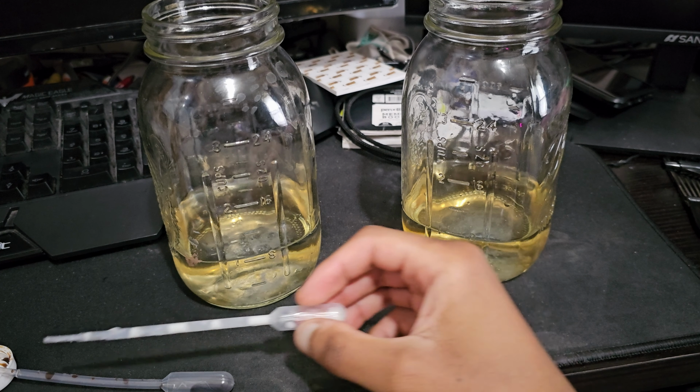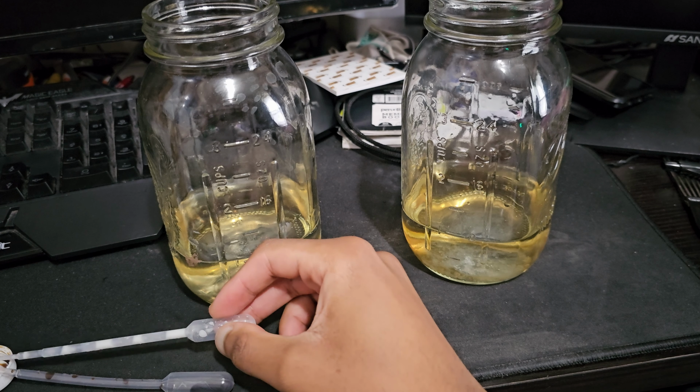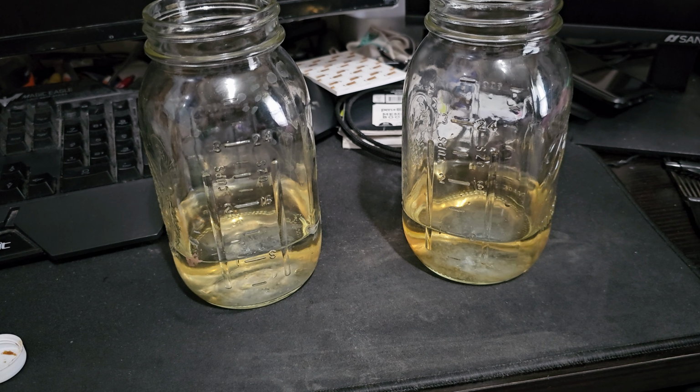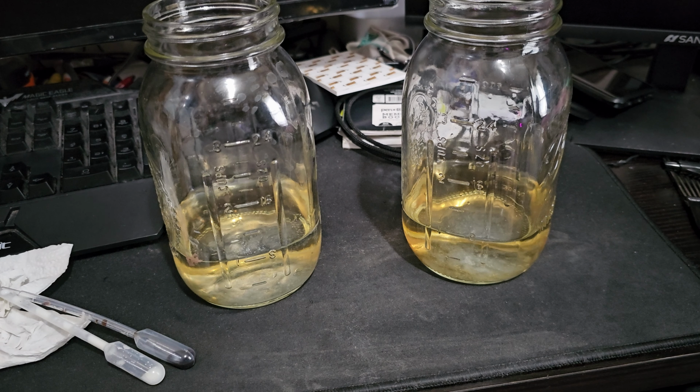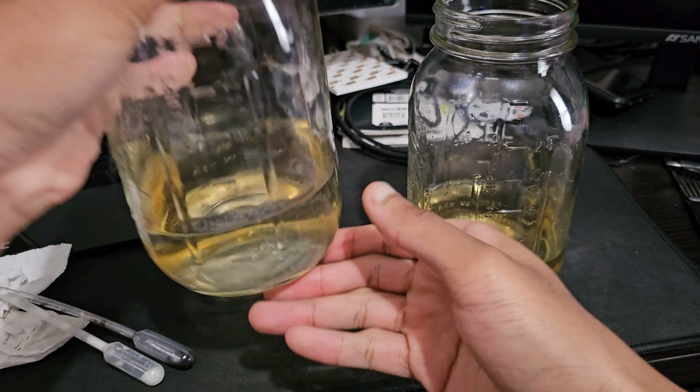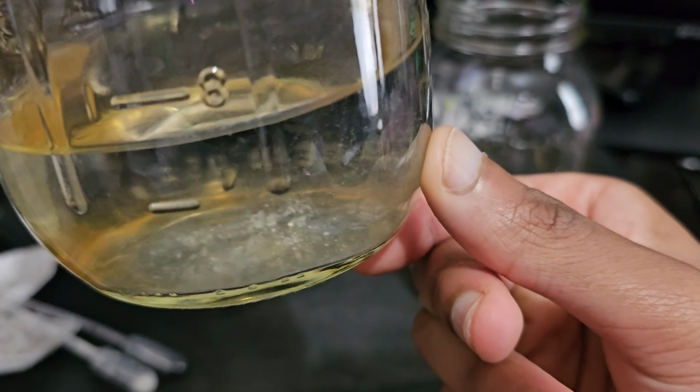So we'll do that, and we'll let those sit. I don't want that touching. Let me go get this towel real quick. I think I'll let those sit until Saturday. That's about 72 hours. I can see some clumps of milk at the bottom there. Let me hold this carefully. See that?